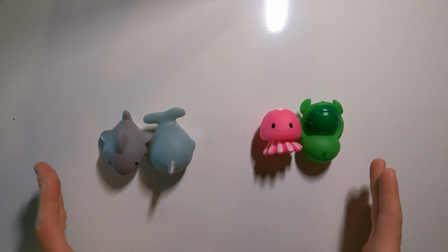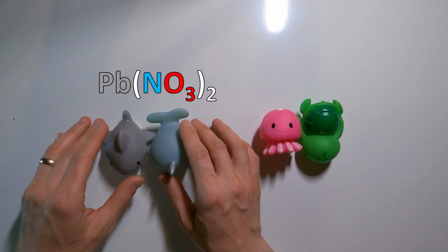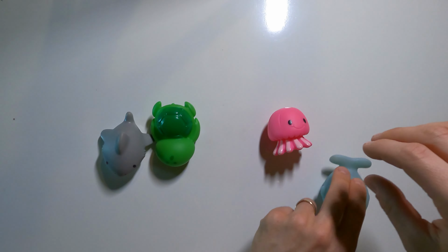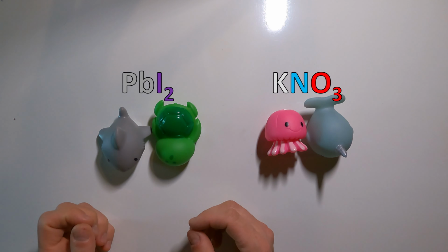So in the double replacement reaction that we just saw in the lab, we took lead nitrate and we reacted that with potassium iodide. What we got was that brilliant yellow precipitate. So if we look at our dancers on the dance floor and think about what all of these particles were doing, over here we had our lead nitrate, over here we've got our potassium iodide, and what happened was the iodide came over here and kicked the nitrate out of the lead, and we ended up with the lead iodide as a product.